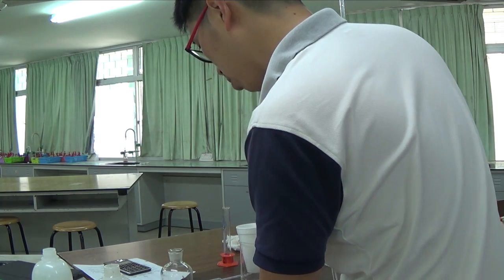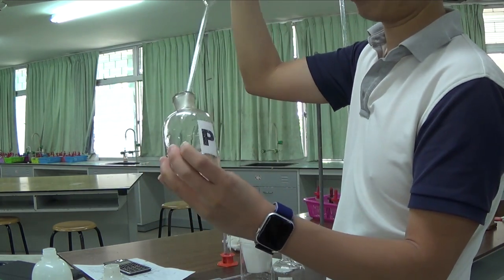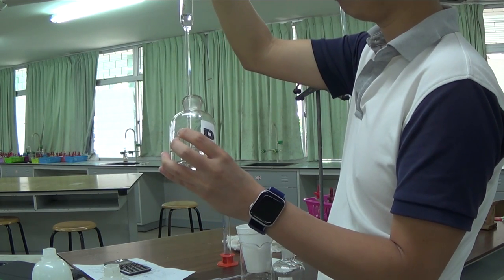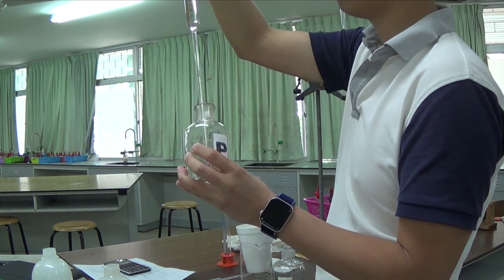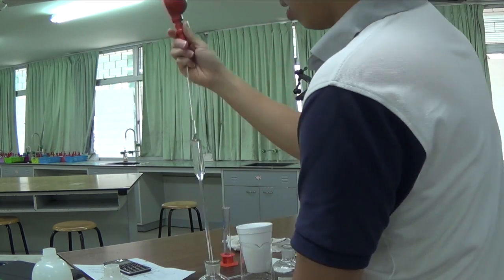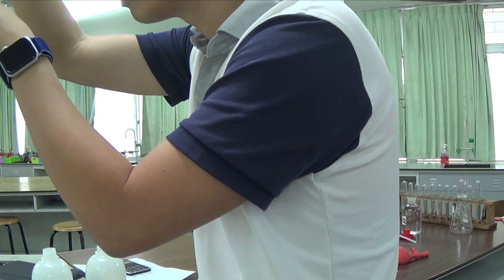So we are going to pipette P. So this is P. I was just rereading the question. Because you know, I'm very forgetful, and sometimes once you make certain mistakes, it will be detrimental, it will be really, really disastrous if you read certain things incorrectly, especially in practical. Just make sure that in the real thing you never make this kind of mistake.